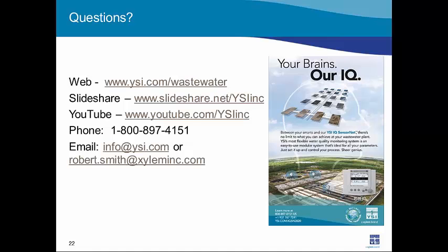Okay, great. On to the next question. Is a nitrate probe able to differentiate between nitrate and nitrite?